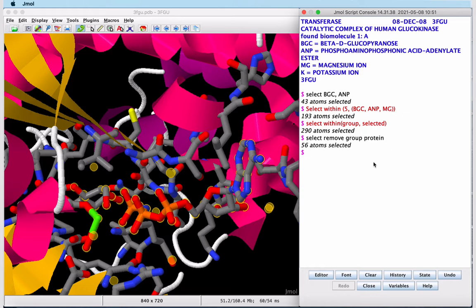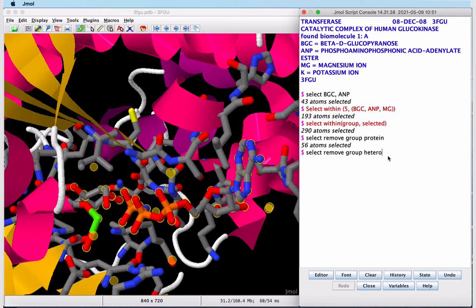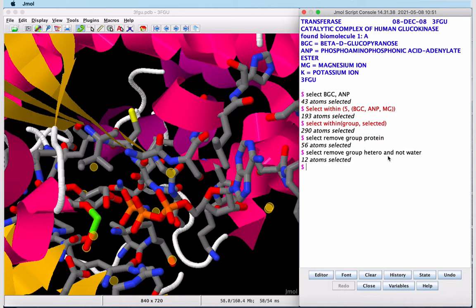This is a similar command, so I'm going to use the up arrow on the keyboard and modify the code that pops up. This is the code we just executed. I'm going to remove the heterogroups and not water, since JMol considers water a heterogroup as well. When I execute, our ligands are no longer selected and just the water molecules are.